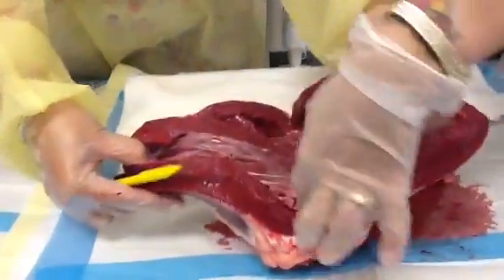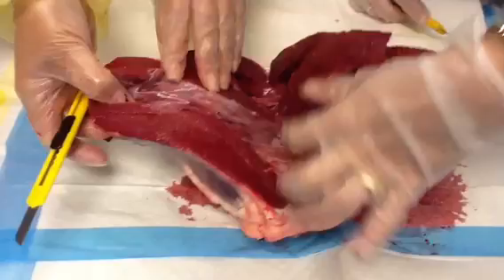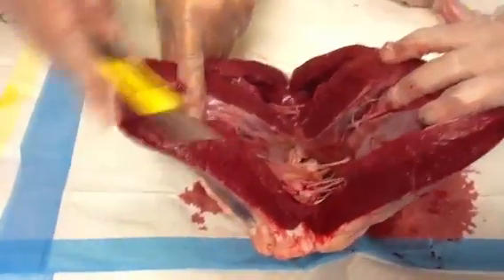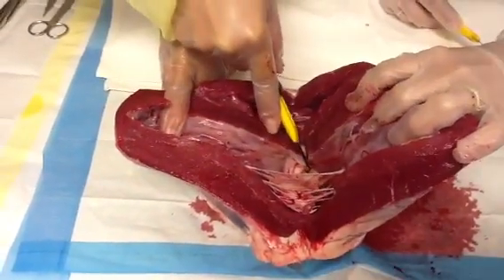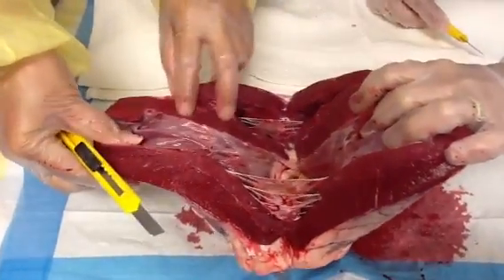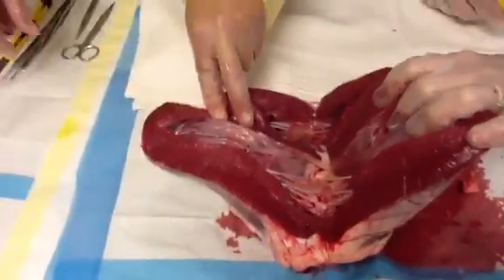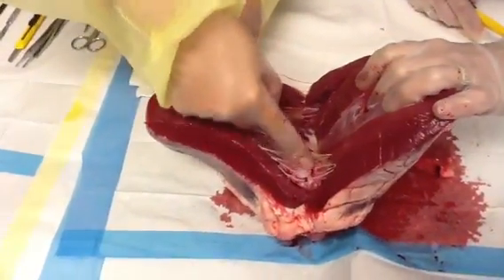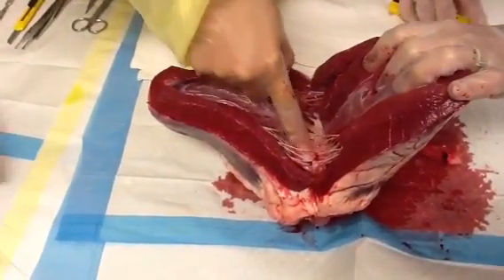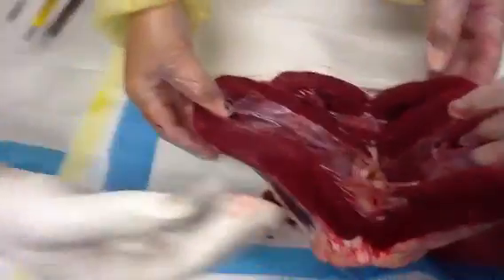Y'all can put some gloves on if you want. There's your valves. I'm cutting into the valves — look at that. You're going to be a YouTube star by tonight. There's your septum. Look at that — beautiful, beautiful. It's gorgeous. It's just like a parachute. That's awesome. You can touch it — put some gloves on and touch it.